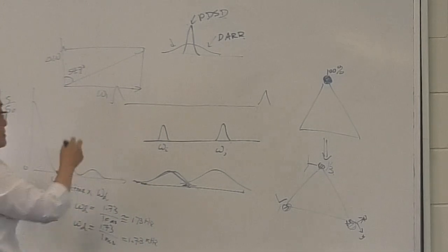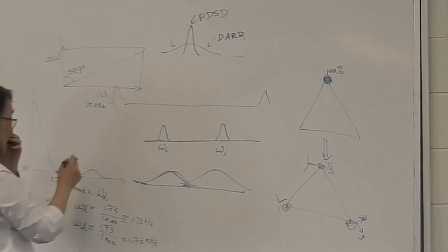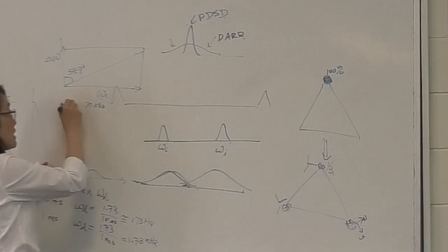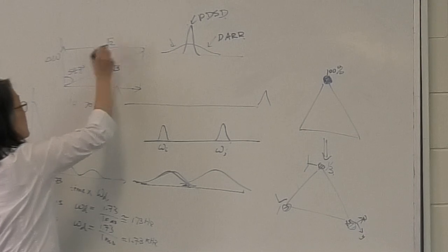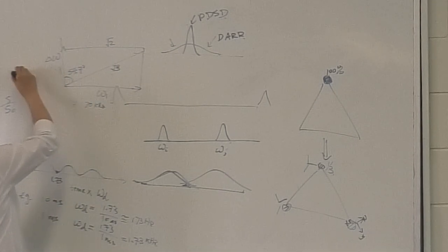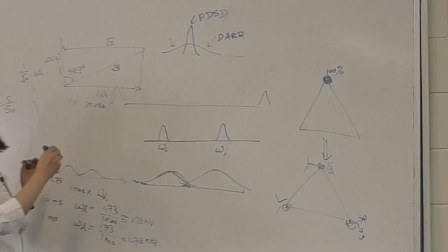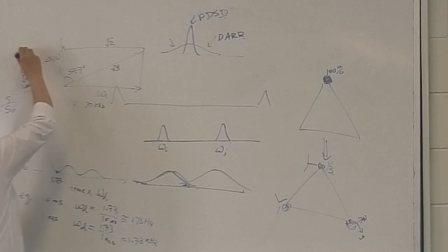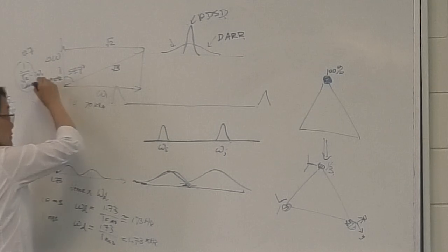So let's say I want to put out 70 kilohertz omega 1, right? Then I have to be very purposeful that 70 kilohertz on the proton side is not on resonance at all. This is square root of 3, square root of 2, this is 1, that's my magic angle. So then this has to be 1 over square root of 2 times whatever you're doing here, right? So this is 1.4, and so this is 0.7 times this. So I'm 49 kilohertz roughly off.